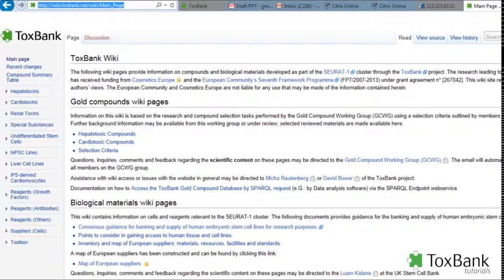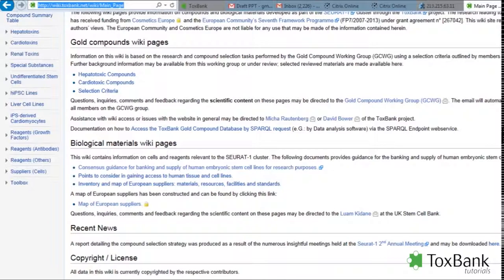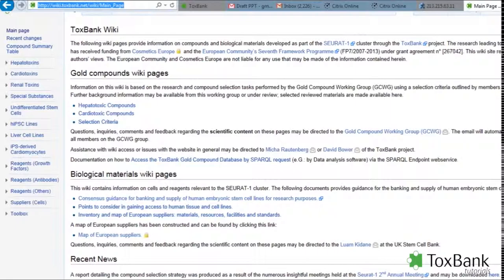So to get to the Toxbank wiki, type in wiki.toxbank.net. Here you can see some general information on the gold compounds and also cells and cell lines and supplies of cells.